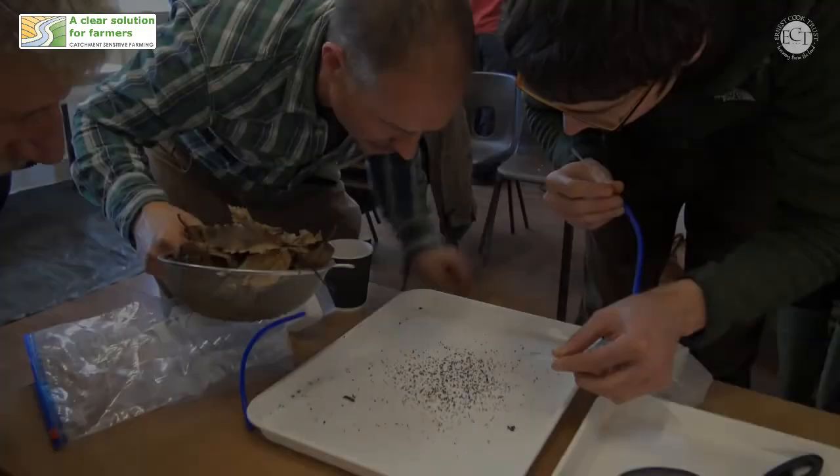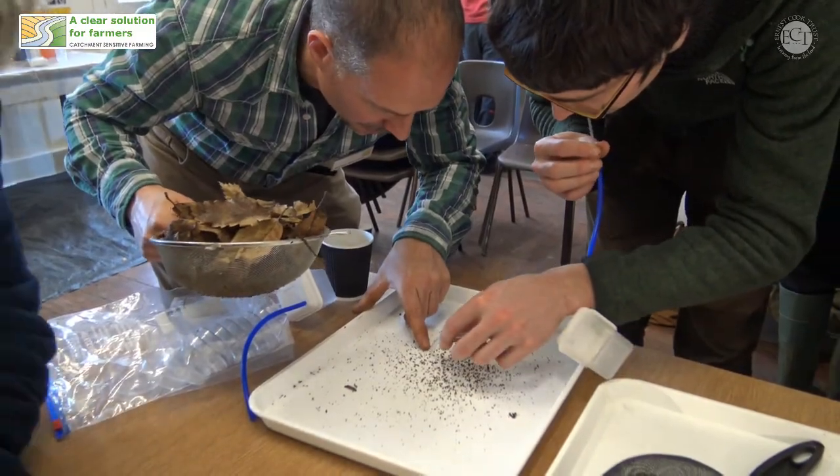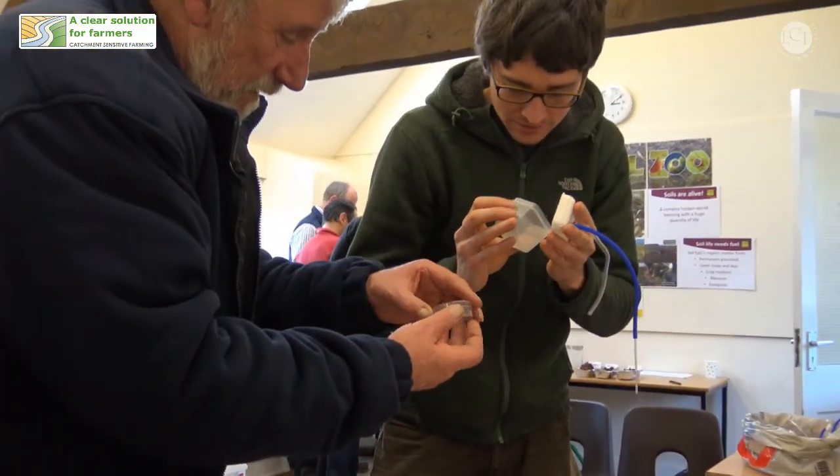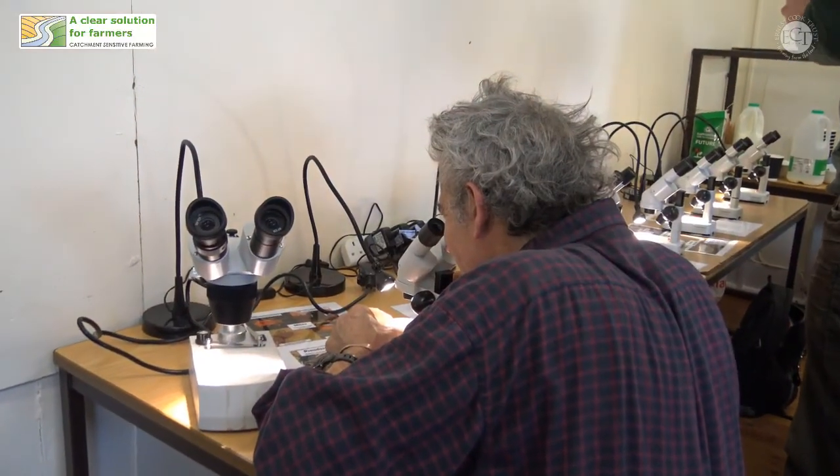What we've just done is a very good way of having a look at some soil mesofauna, but it's not going to be able to sample all of the animals that are in that soil. There is a much more thorough way which anybody can do, and it involves a piece of equipment called a Tullgren funnel.